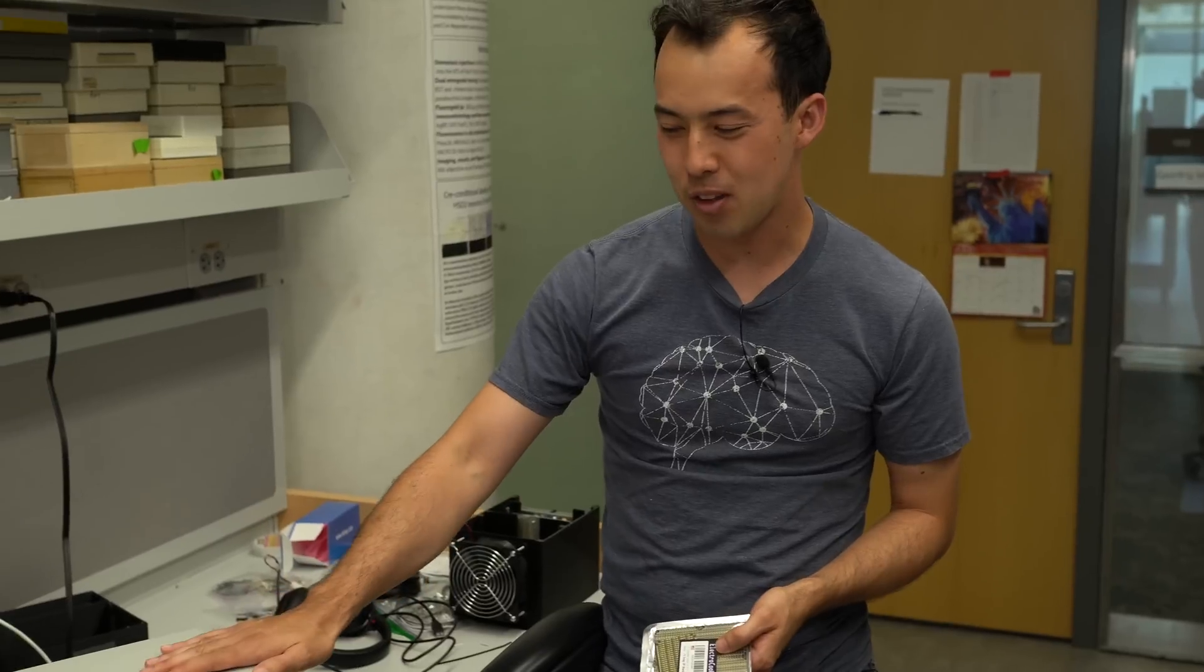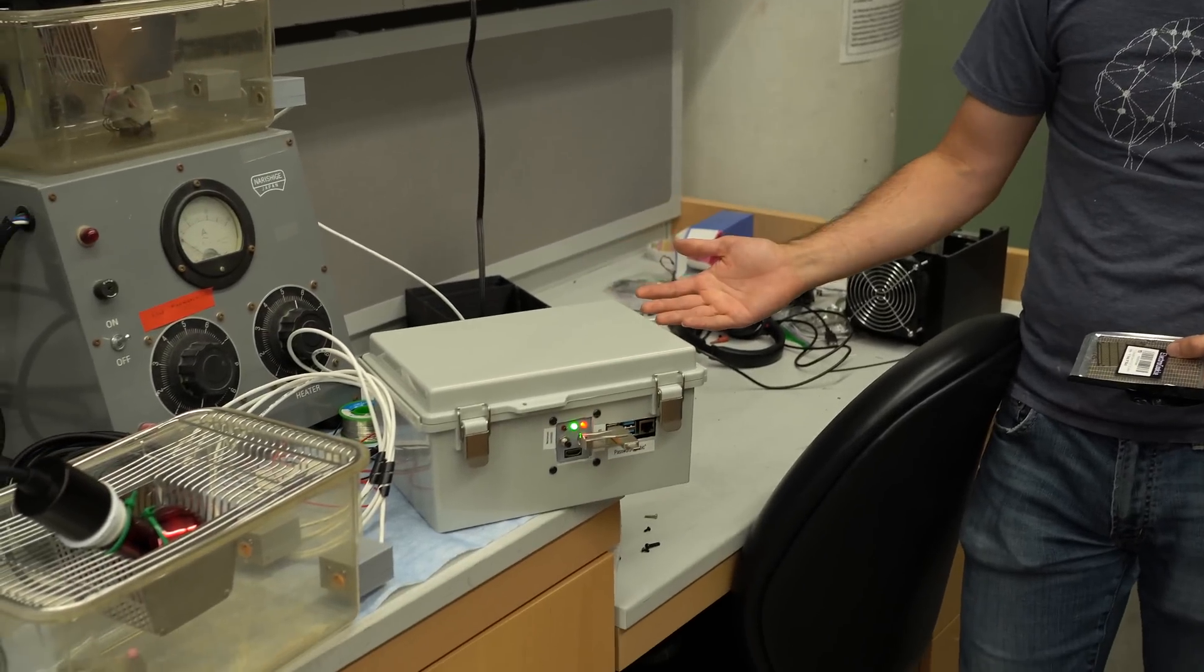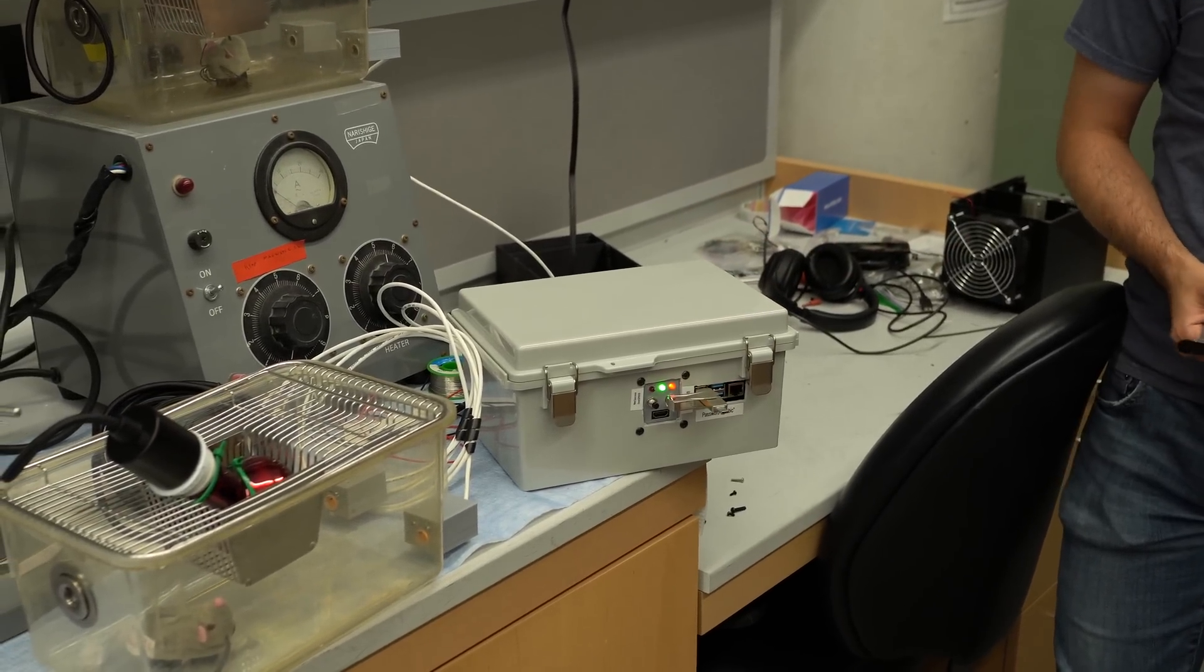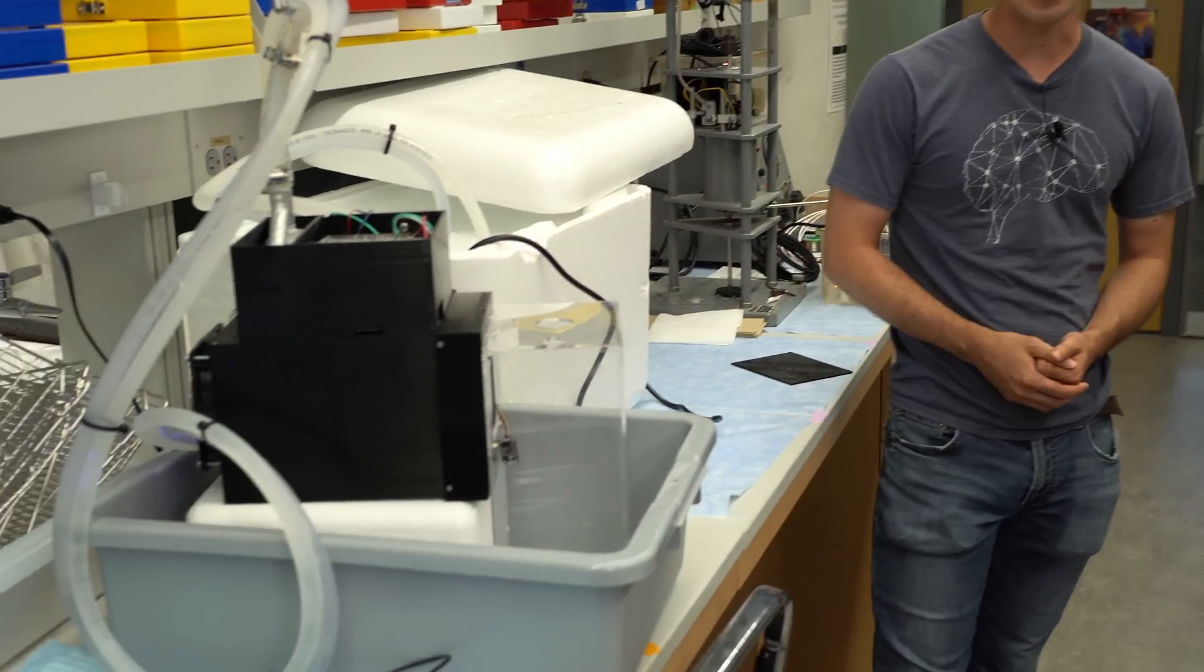Yeah, by putting a static charge on it. And so my dad luckily stepped in and he helped me build this. And as you can see, it's everything I could ever want. So this one, I actually started off building on my own and the first few passes were pretty ugly. And I finally got it to work, but it was just very temperamental. There were wires hanging out. It wasn't enclosed at all. And so my dad stepped in and offered to help me build this better version.